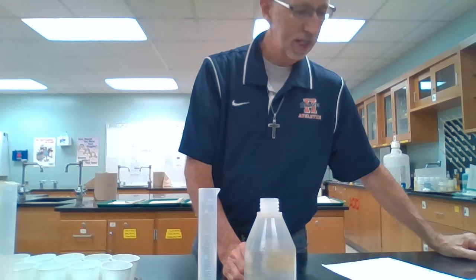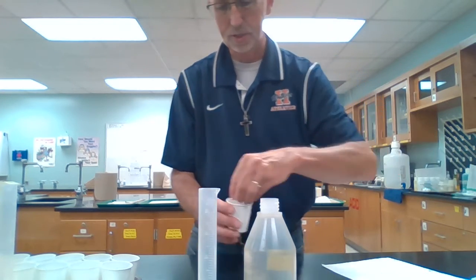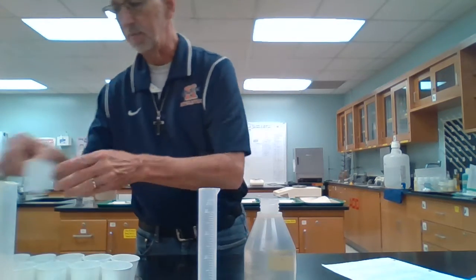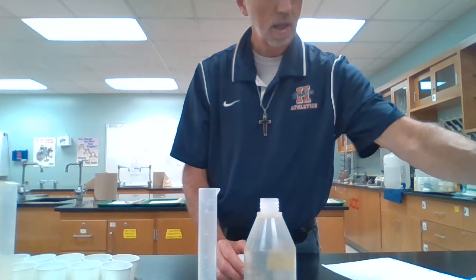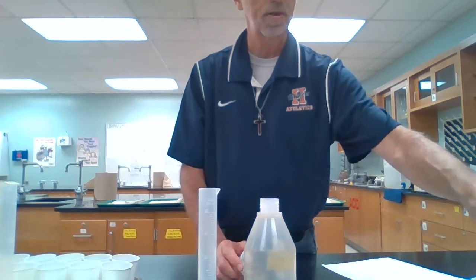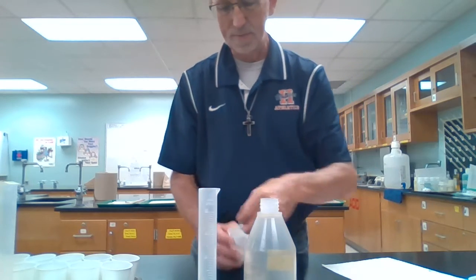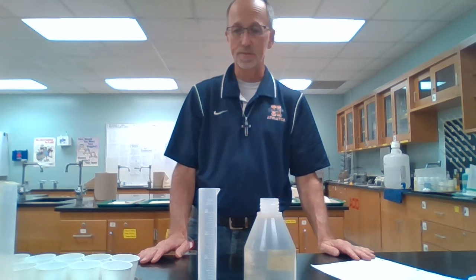Number 5, 32.92 grams, 32.92. And our last one, number 6, again, got some bars again, 38.39 grams, 38.39. So we have the masses now for all of our samples. So now we'll go back and do volumes. All right.